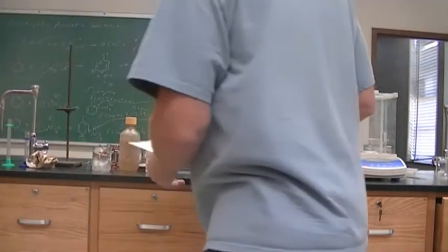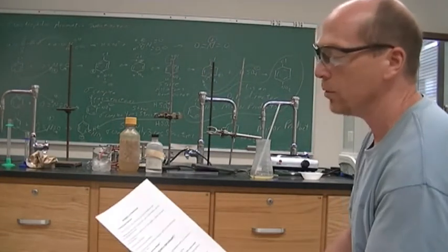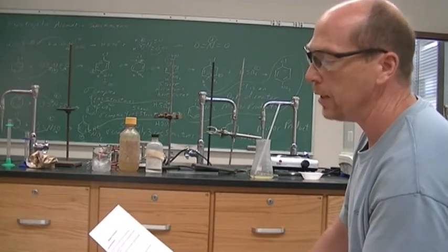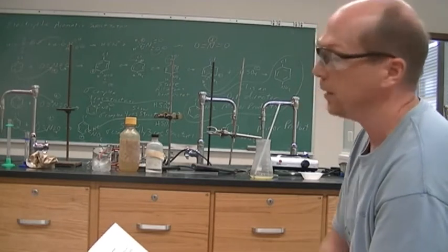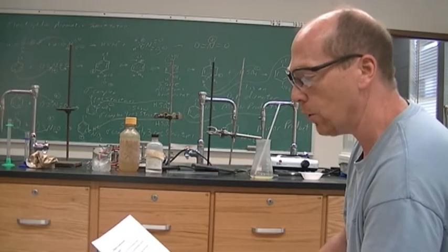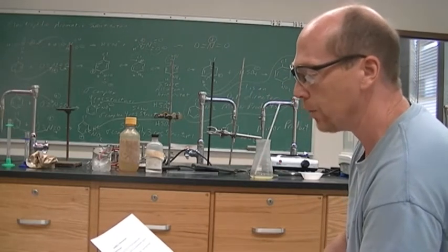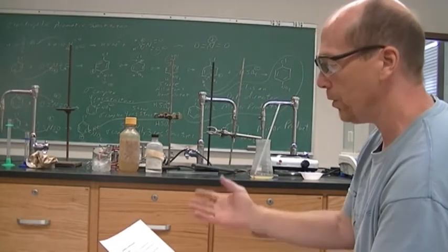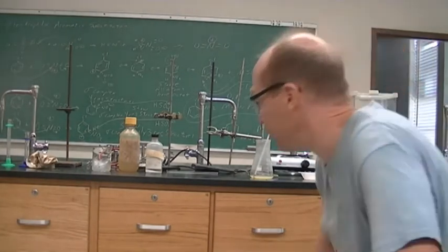So into that flask I added 7.5 mL of concentrated sulfuric acid, 2.5 mL of concentrated nitric acid, and in the hood I heated it up to 70 degrees Celsius. Then I added the chlorobenzene, and then the heat shot way up, and then it's been heating for the last 20 minutes. And so now I'm going to pour that onto the crushed ice that I have in the beaker here. Then we're going to collect our solid, get a mass and a melting point, and we are finished.